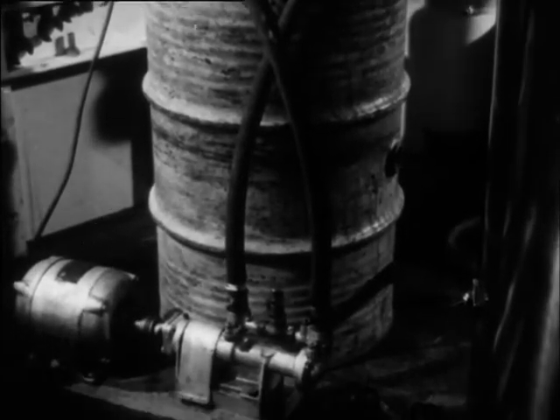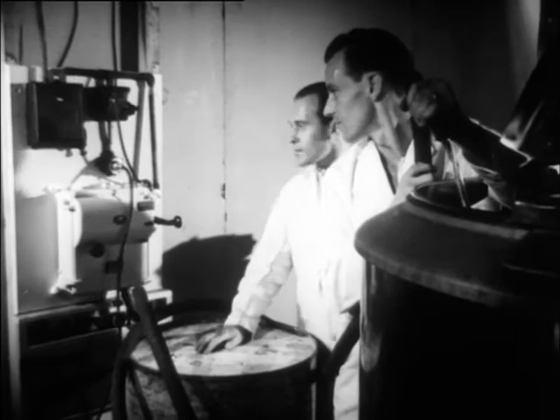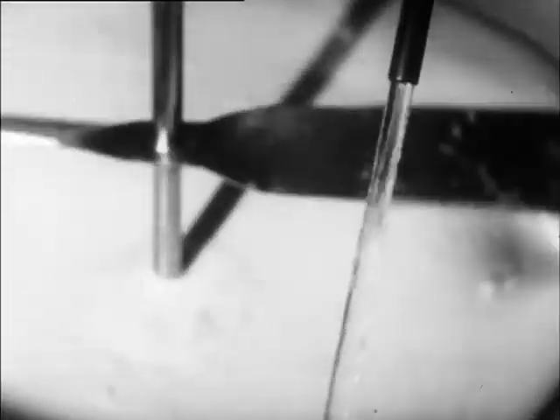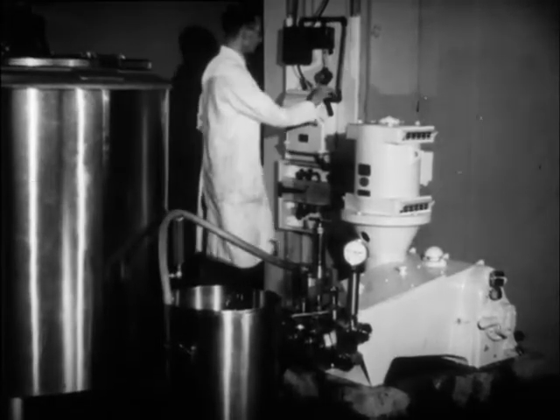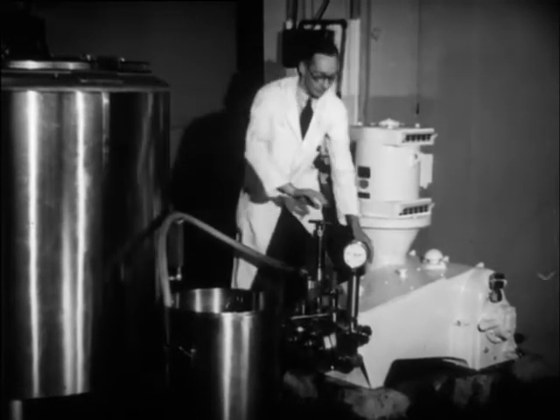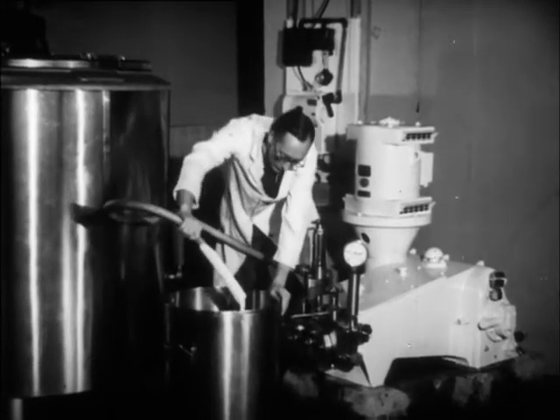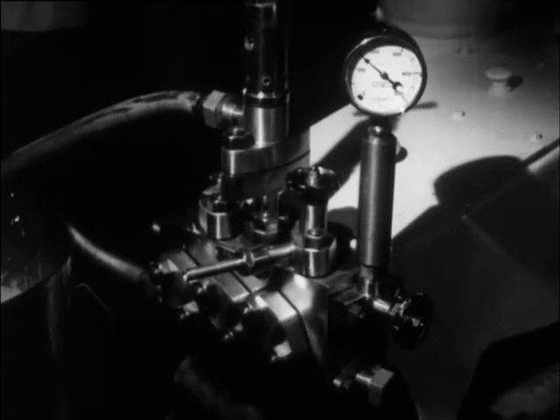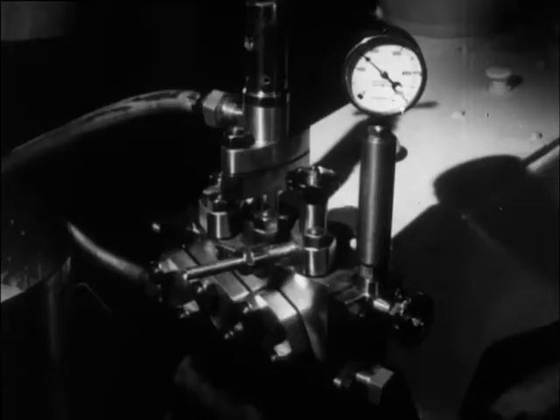Industrial methods of making emulsions always employ a mechanical action. This usually involves high speed stirring in a confined space, which is equivalent to grinding the two liquids up into minute particles. Another method is to force a coarse mixture of the liquids through a very fine orifice. Industrially the process is known as homogenizing. The mixture of liquids passes through an orifice about two thousandths of an inch wide between a fixed and revolving wall rotating at about five to ten thousand reps per minute to make 400 gallons per hour. Such machines require about 30 horsepower.